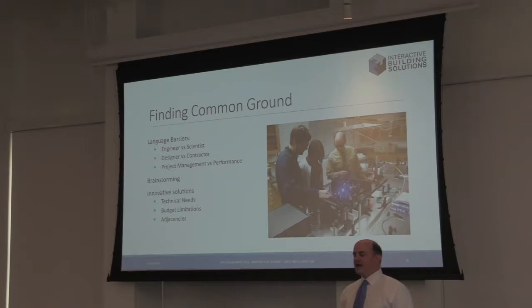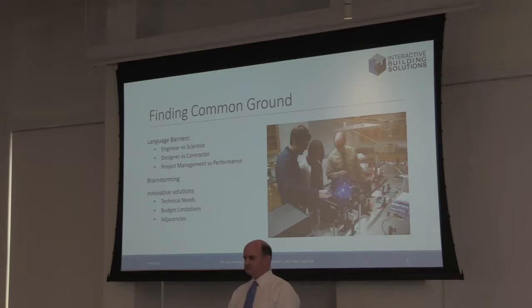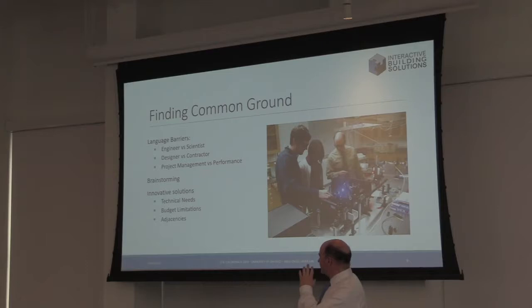These are the kind of things that happen all the time, and they happen a lot to young scientists, because you haven't been around the block before, you don't know what can go wrong, you're doing it for the first time. So talking to an engineer who can really understand the scope of this, think about what you actually mean when you say something rather than just exactly what you say. So when you say, look, I absolutely need 80 PSI of water pressure, okay, it's a true statement, but it's not really what you mean. What you mean is you need to push water through something with 80 PSI, so you need a delta. And it's just little things like that cause a big problem.